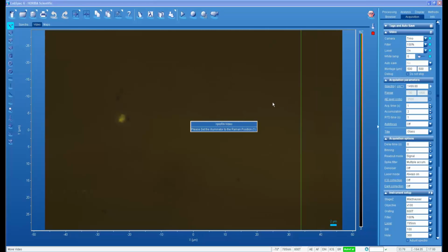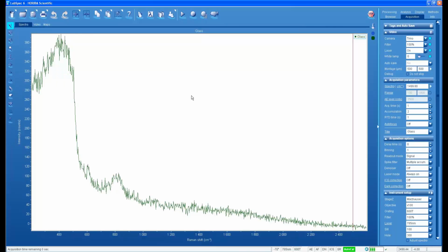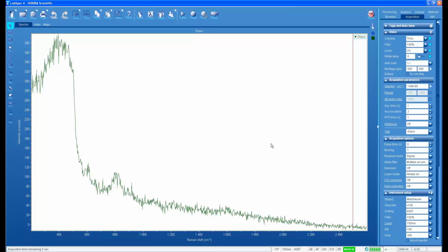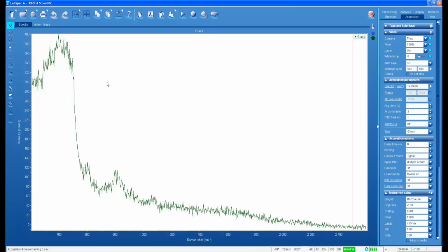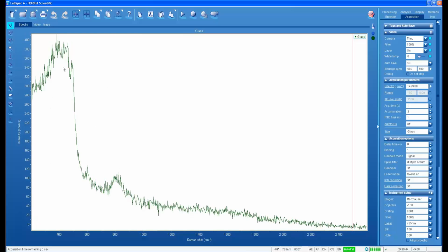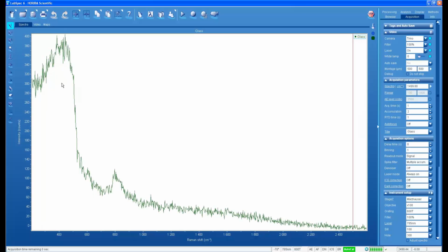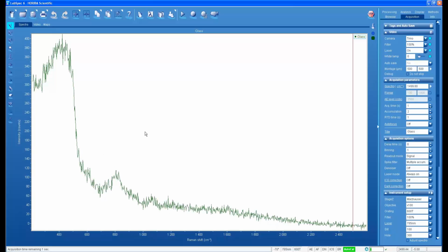I'll stop the reflected light imaging and now move the selector to number 1 for real-time display, and we again have 785 nanometer excitation, and with that you see that the luminescence that we saw with the glass microscope slide is entirely gone, and all we see now is the Raman scattering. This is all Raman scattering from the fused quartz. Alright, and it's far, far less intense than the luminescence.